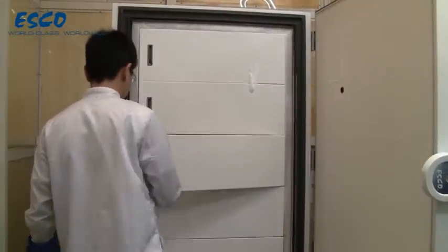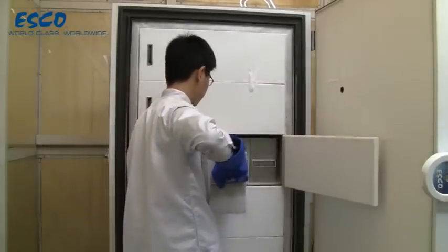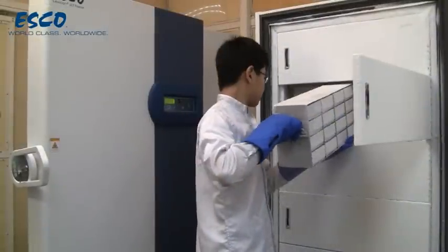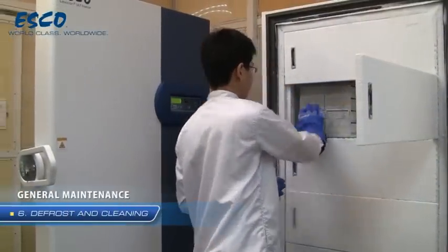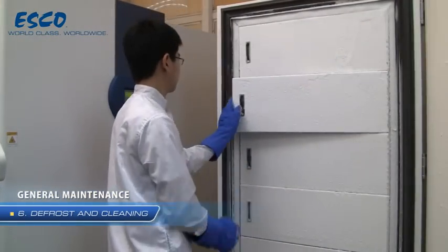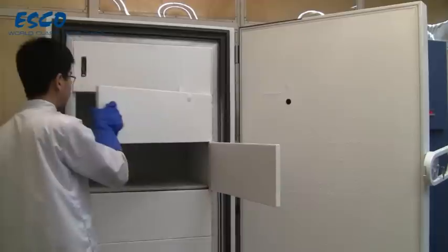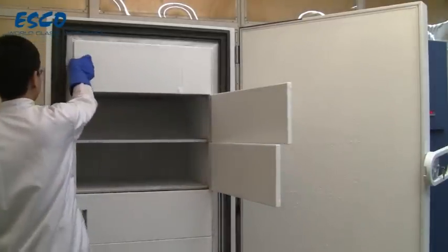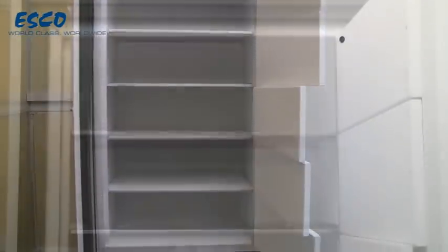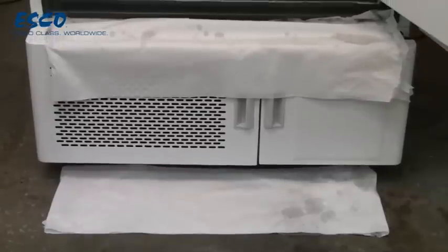To remove the frost, move all products to another freezer that operates at the same temperature as the Escode unit temporarily. Turn off the power to the Escode unit. Open the outer and inner doors to let the unit warm up. Place some towels or other absorbent material around the freezer to absorb any melted frost that might run out.